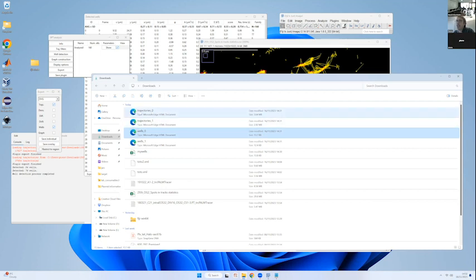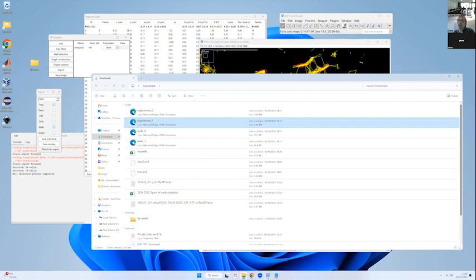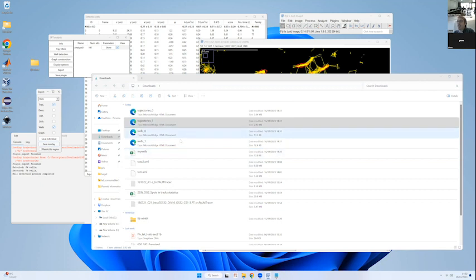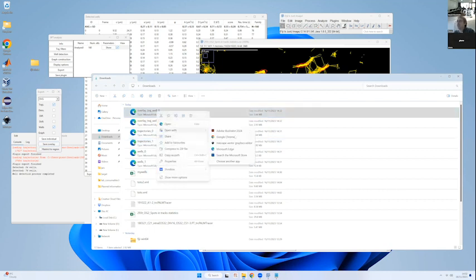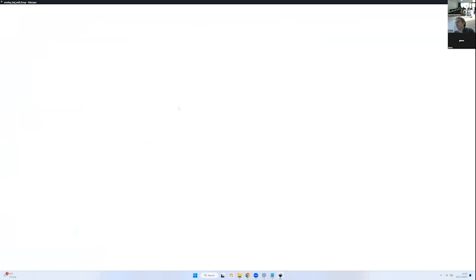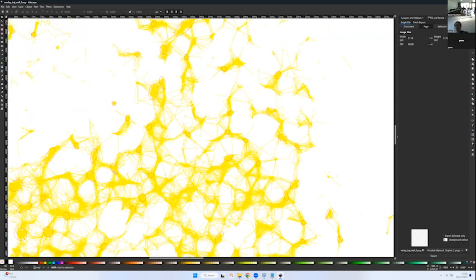And we have one image created for each time window, exactly as you would have in the main display. Now, what's more interesting is to do save overlay, and it will save everything on the same file. So now I have a file that's called overlay traj well. Why don't you open an overlay so people see? Yeah, I'm opening it. So the idea is that if you want to make a picture of all of this, it can be exported, you can open it with Inkscape or whatever you want, and then you get this. So you can use this for making figures.